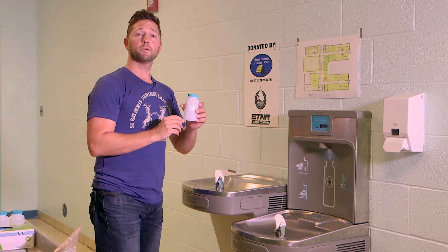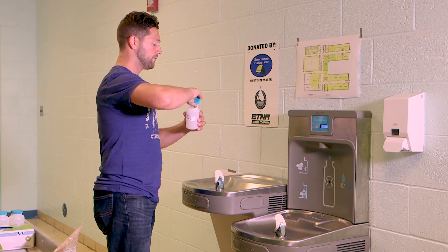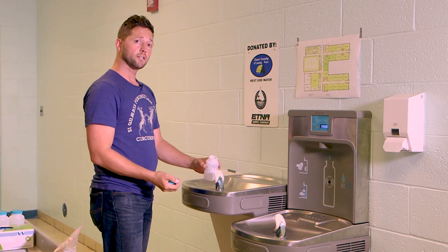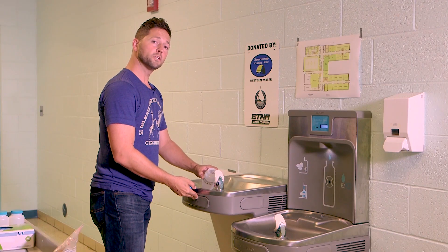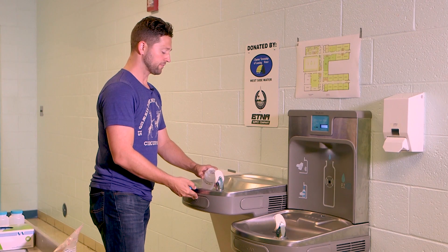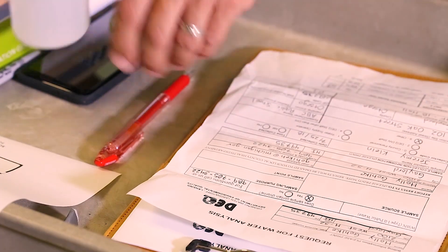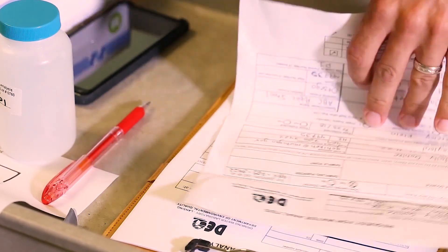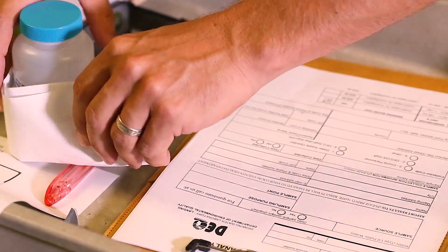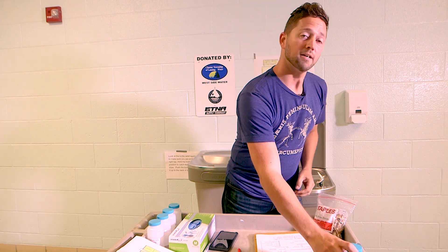Now that we're here, the first thing we need to do is check to make sure we're at the right sample location. To collect the sample, first remove the cap, hold the bottle in position so that you can collect that first draw, and fill it all the way up to the neck, leaving a little bit of room so that the lab can add some preservative. Secure the cap and check to make sure the sample ID on the bottle matches the sample ID on the form. Write in the time, and be sure to keep the paperwork with the sample bottle by folding it, putting it around the bottle, and attaching it with the rubber band.